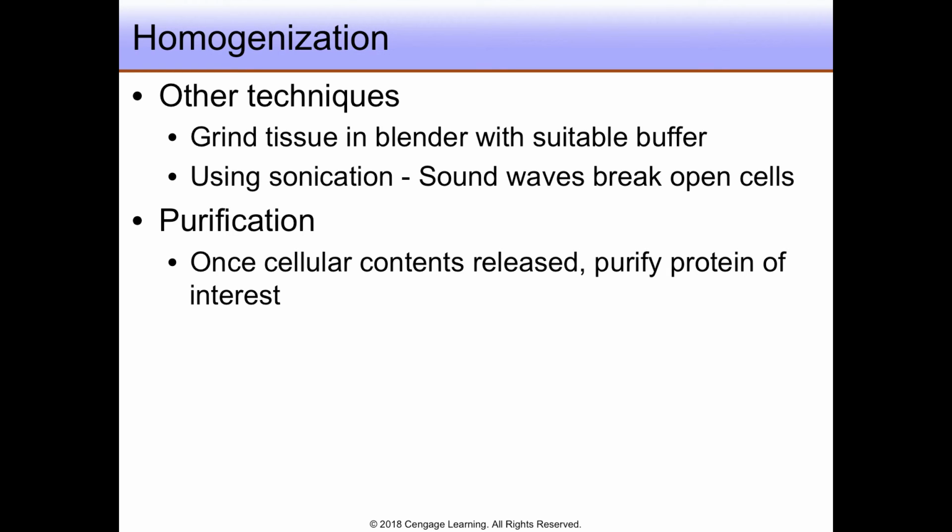Once the cellular extract has been separated from the membrane fraction and collected, protein purification can begin. We'll consider the early stages of purification in our next lesson.